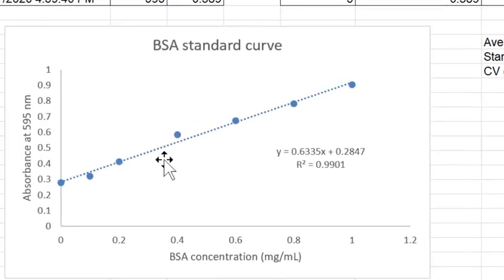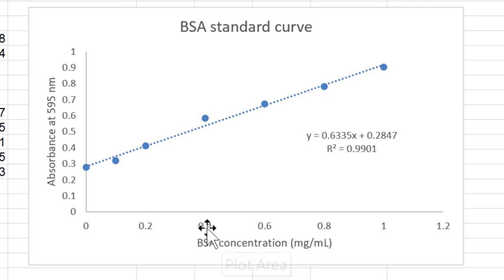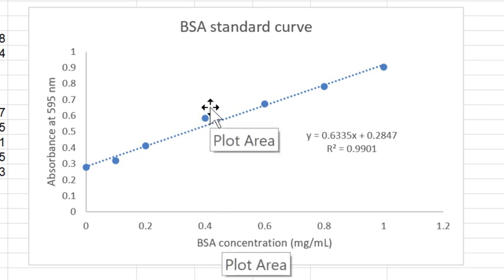Also, when I look at my standard curve, I'm not too happy with the 0.4 milligram per milliliter standard kind of lingering above the curve, but it's a real experiment.